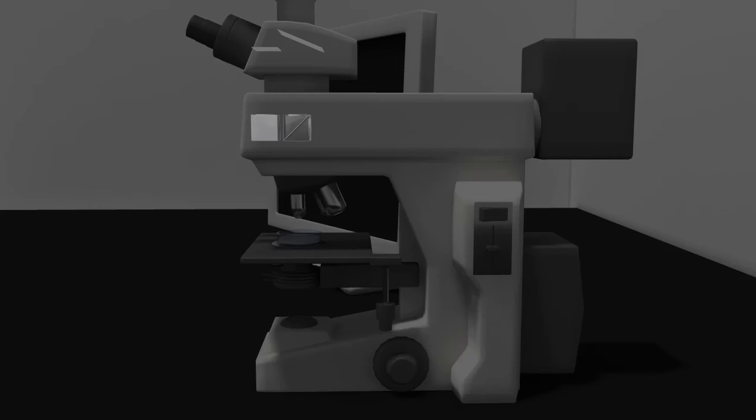In a sample that has been fluorescently labeled, laser light in the microscope or flow cytometer with a proper filter to excite the fluorophore within its correct excitation range can excite the fluorophore. The emitted light can be detected through detectors in the flow cytometer or through the microscope's eyepiece or camera.